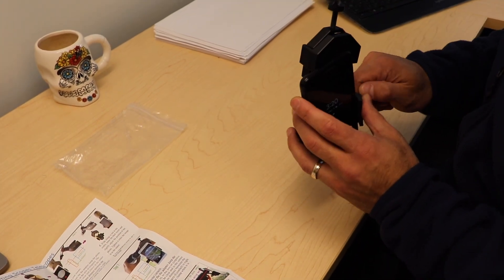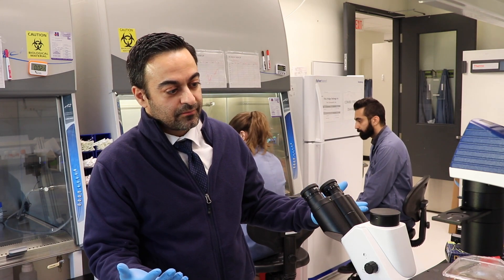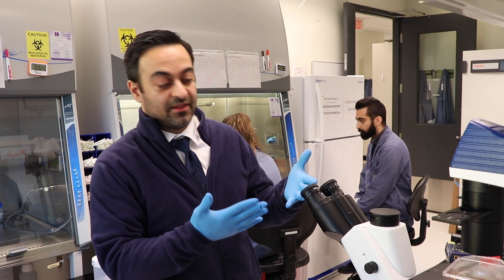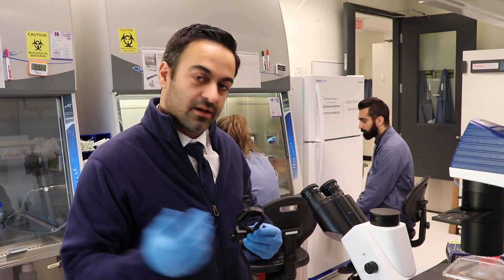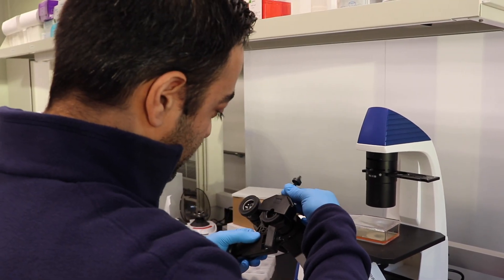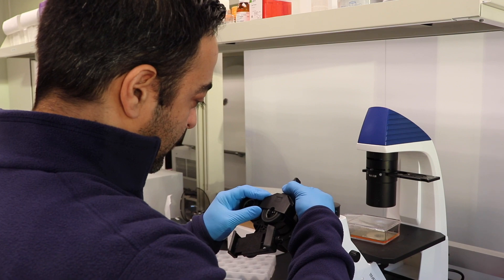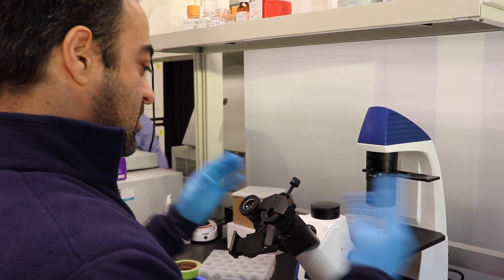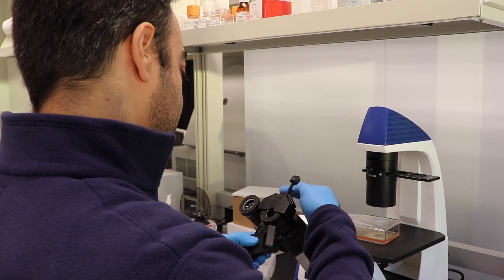Here we are in the lab looking at some cells. It's very difficult to show you what's visible because this microscope doesn't have an external monitor for sharing what's seen through the binocular eyepieces — and this is exactly where this gadget shines. We place the vise on one of the two eyepieces and screw it in. Then we move the eye guard to about halfway, which helps guide where the phone will go, and then remove it.